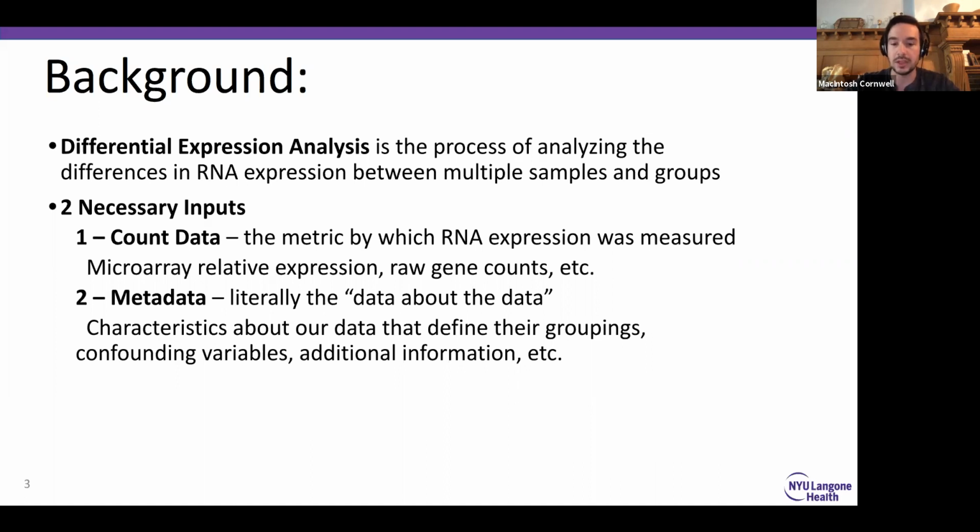and what samples fall into B. But your metadata will also be comprised of the information that can be used to, one, either further inform the comparison you're making, if there's some kind of either paired analysis, batch effect, or any other kind of variables that you want to control for, or at least include in your model. Or two, if there's any information you want to use in later visualizations, you can leave it in the metadata and then just not include it in the model.